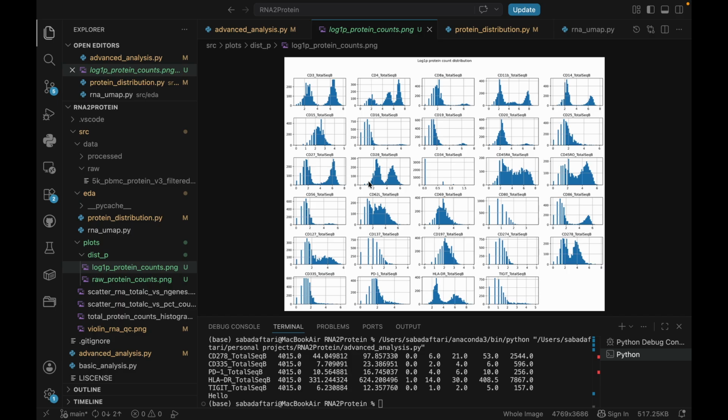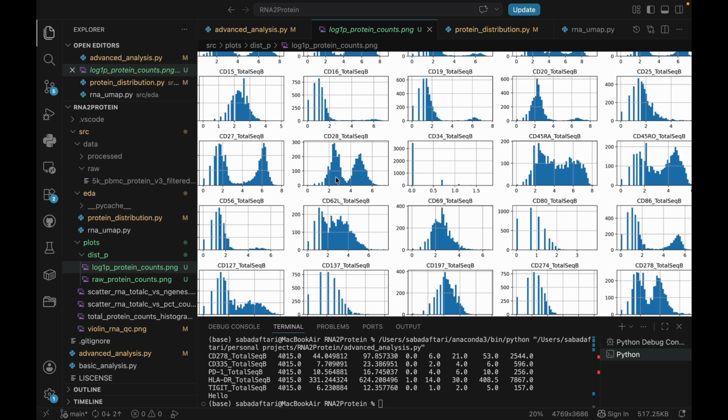In this case, it probably means the protein has dynamic range and it varies meaningfully across cells. And so the model has actually something to learn, like an RNA pattern that predicts low versus high. So you get kind of a range, you know.